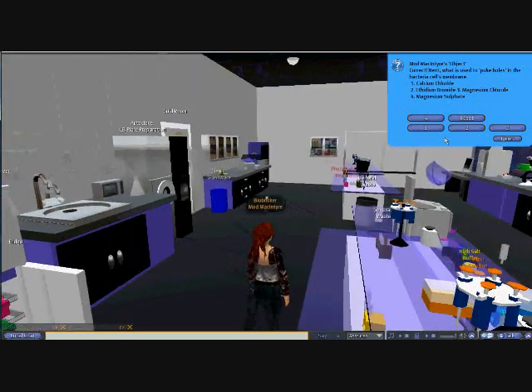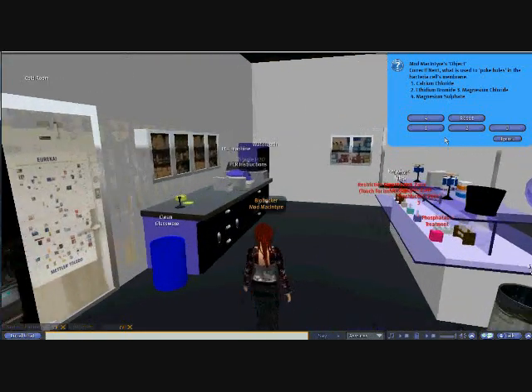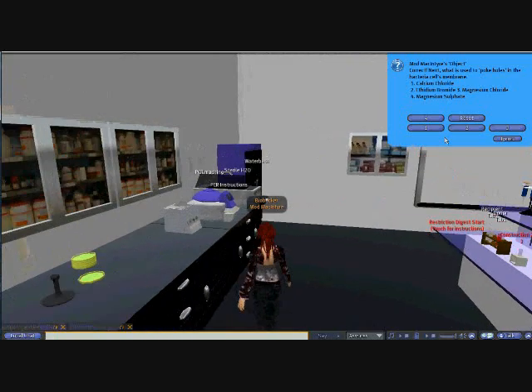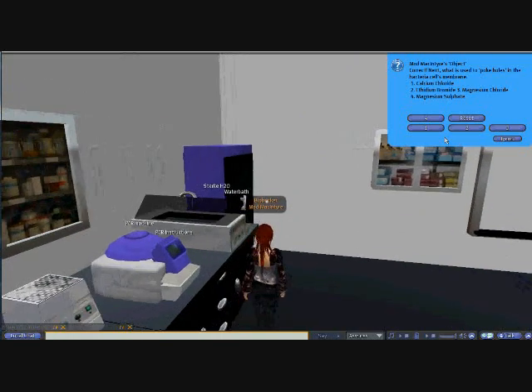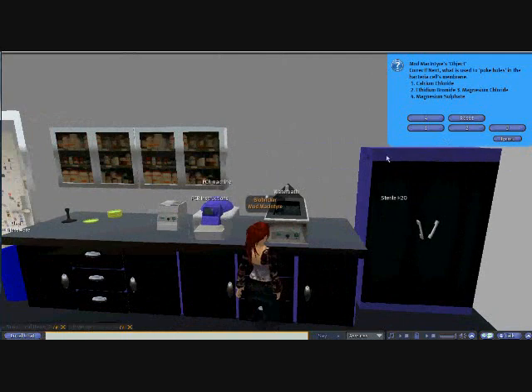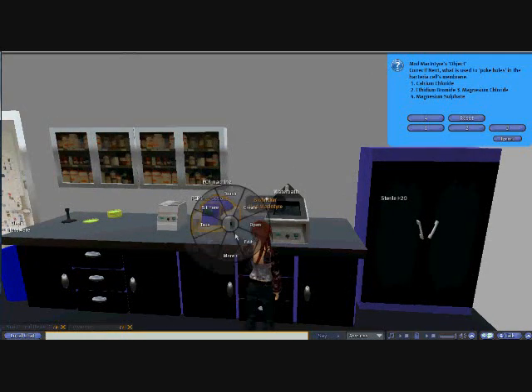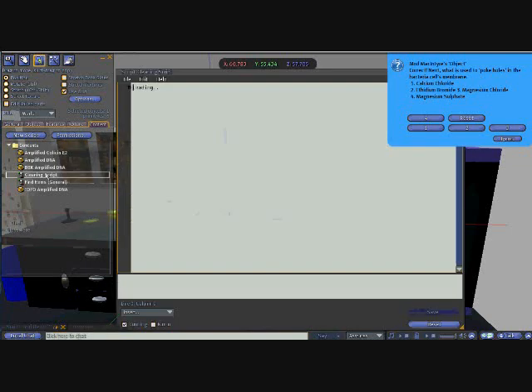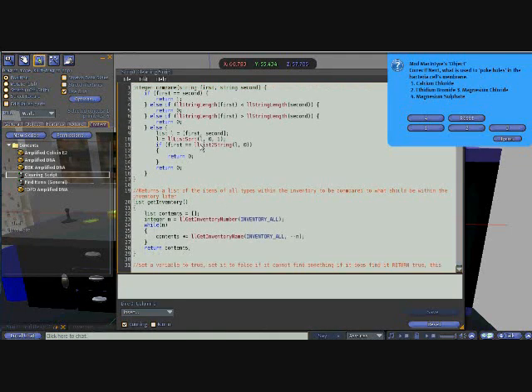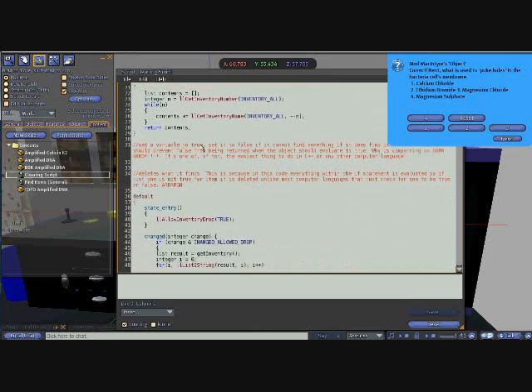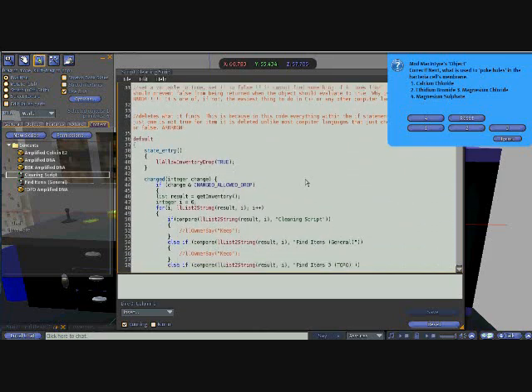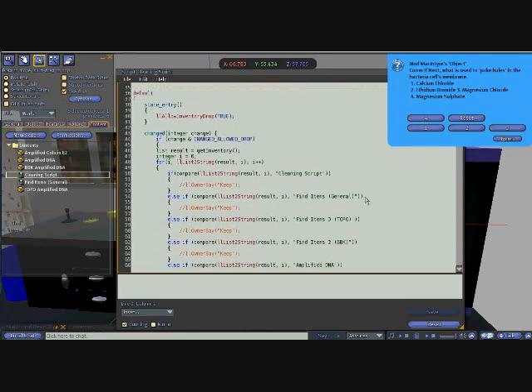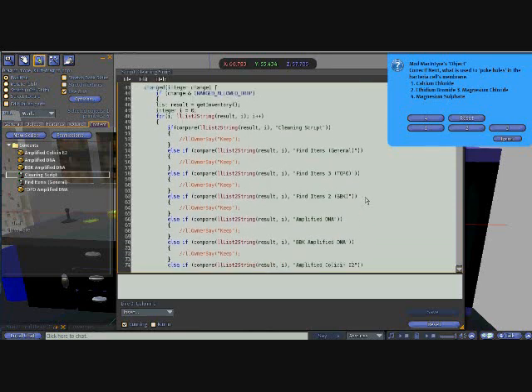With the constant addition of things to objects, I have also made a cleaning script, which can filter out anything that is not needed within the object, and it is functioning at this time within the PCR machine, and this uses the changed event for changed inventory.